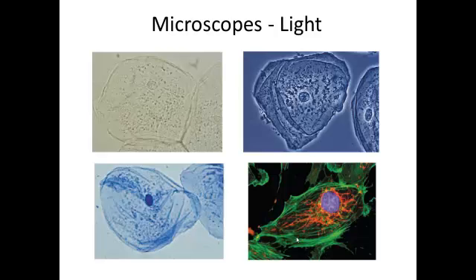With the cell color-coded in this way, we more easily visualize the structure of the cell. We see more detail than we would with one stain that attached to everything, like the stains we use with a bright field microscope. The type of microscope that we use with fluorescent stains is called, thankfully, a fluorescent microscope.